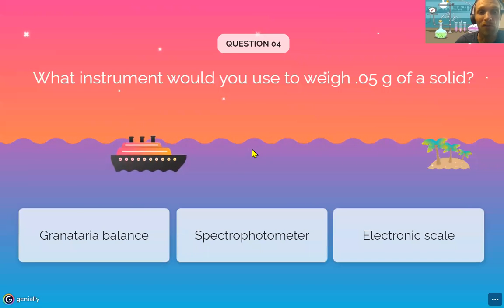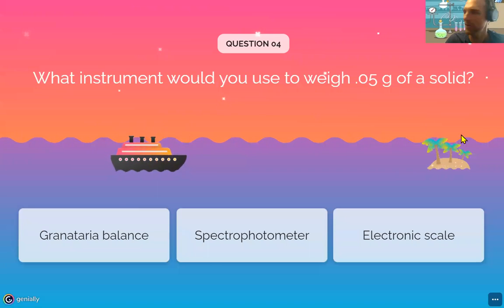The price of this little thing was 25,000 pesos for 5 milliliters. What the liquid did was basically allow bacterial DNA to be fused with other DNA. So it's very, very important, and liquids can be really expensive. So small amounts, they do matter. I learned that the hard way.